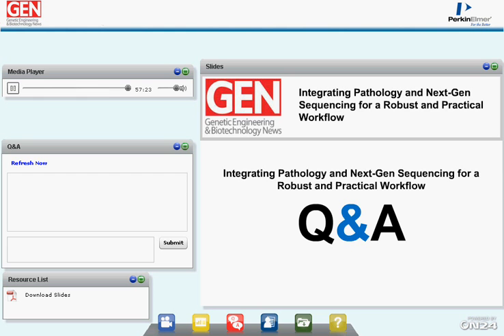All right, Mike, we have time for one more question, and it's for you. Have you ever tested even longer PK at higher temps like 60 to 65 degrees Celsius? Years back, not in NextGen, but in targeted amplifications, we did see in 2 and sometimes even 3 days of prolonged PK that we could get more DNA out of paraffin tissue.